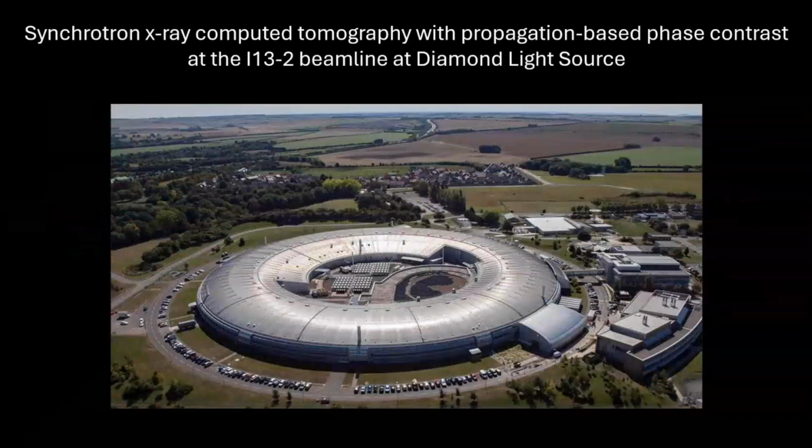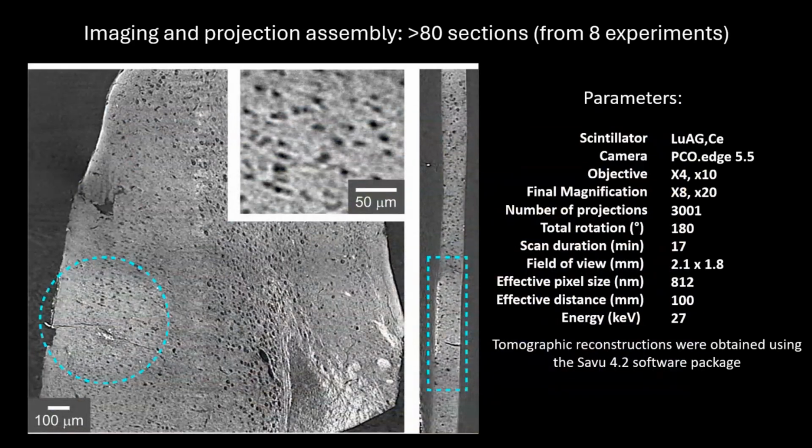So we completed a rapid application and then got to come here to the Diamond Light Source at this beautiful Harwell Campus and do our synchrotron X-ray computed tomography with propagation-based phase contrast. That's the whole name of the technique, at the I-13-2 beamline. In this adventure, we relied on the expertise of Christoph Rau, Sashi, and Leonard, who helped us establish the right parameters for the imaging.